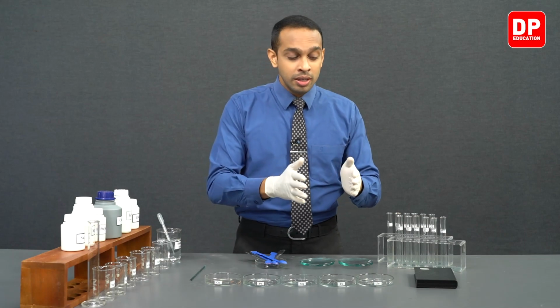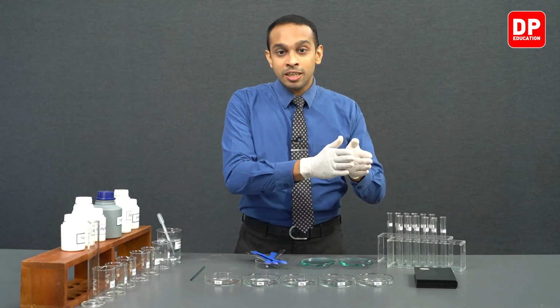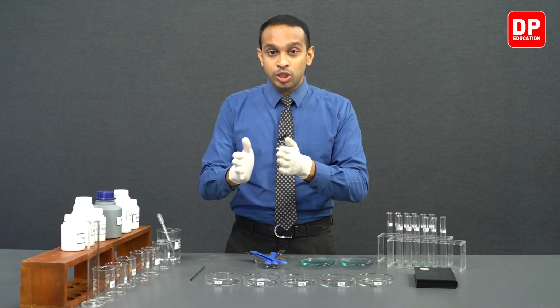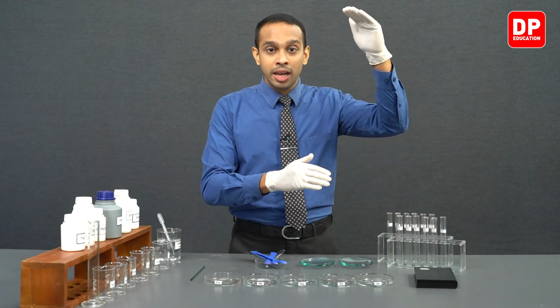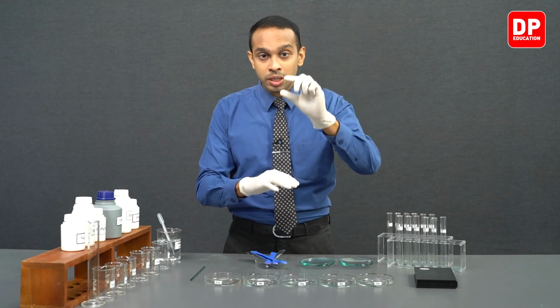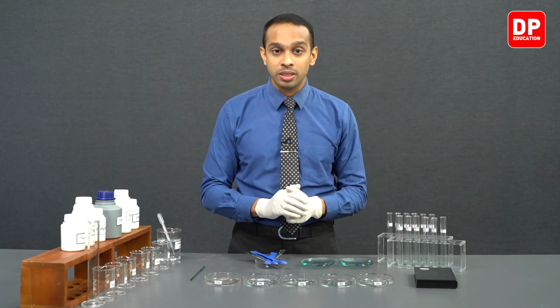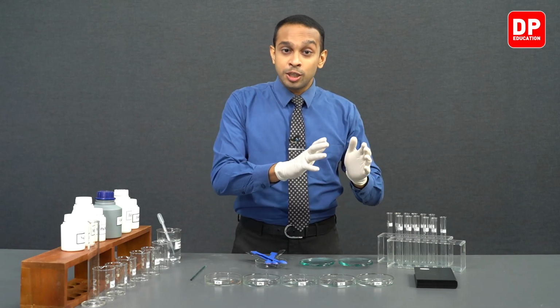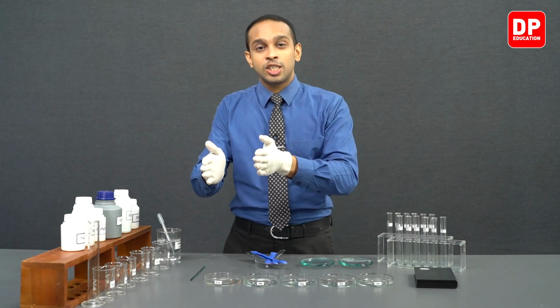For example, if you add a magnesium piece to a solution containing copper 2 plus ions, we just stated that magnesium is higher in reactivity than copper. So when magnesium metal is introduced into a copper 2 plus ion solution, you will observe that copper 2 plus is going to get displaced as copper solid. So you would observe the formation of a brown color precipitate.